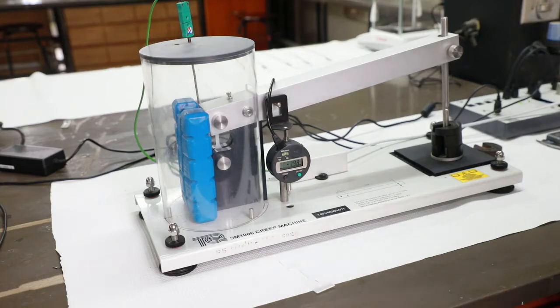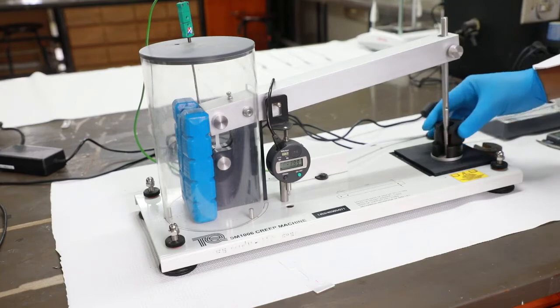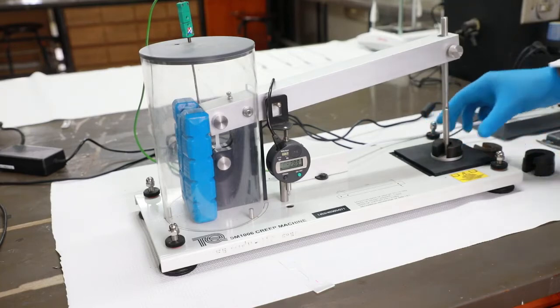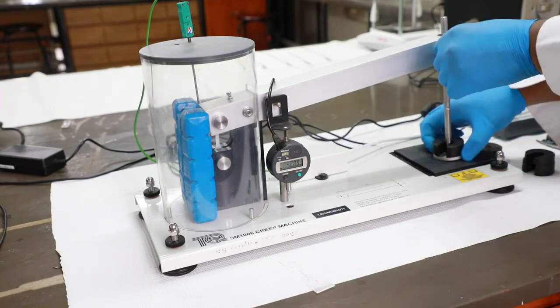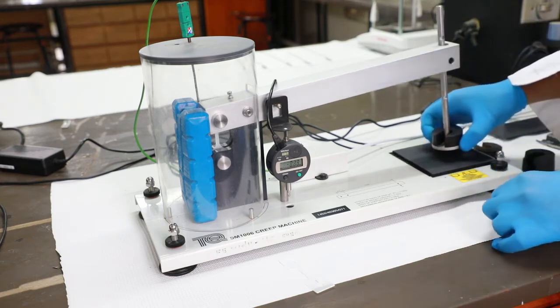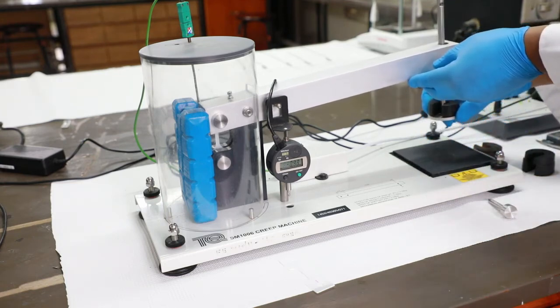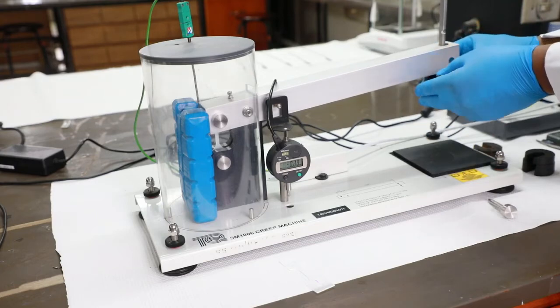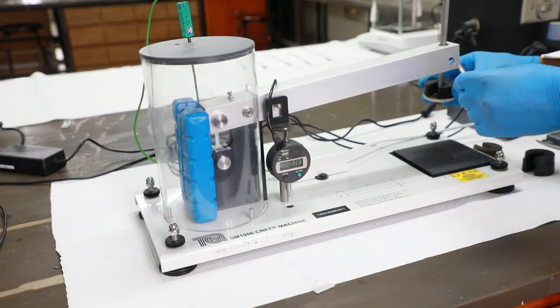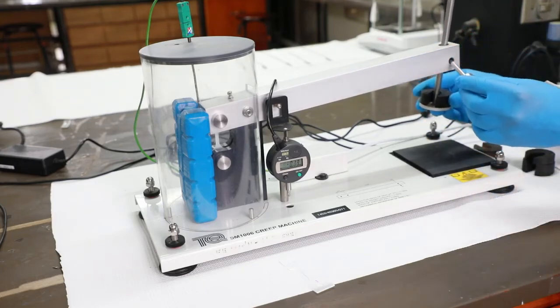Then add a 0.6 kilogram weight to the loading tray while holding the lever arm. Secure the pen.